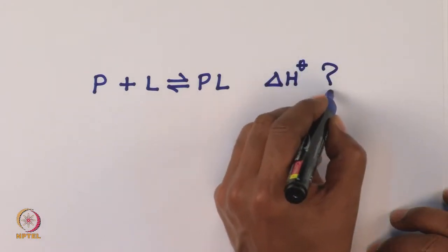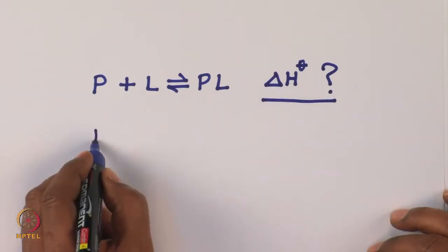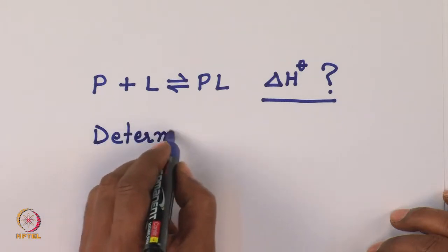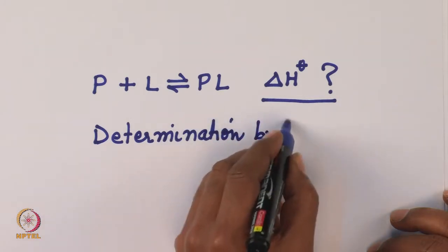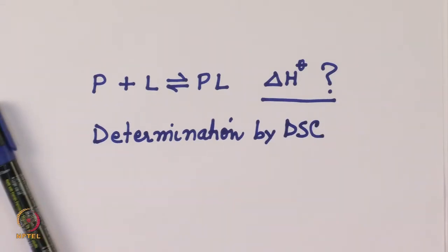This is the question. And we want to discuss determination by DSC. Let us take a look at the figure.